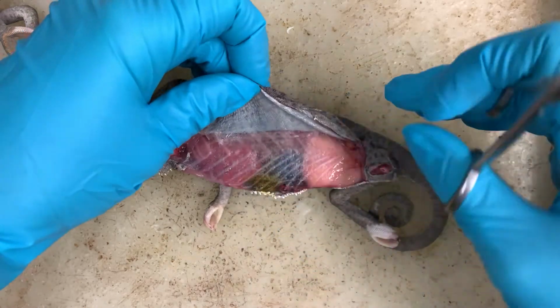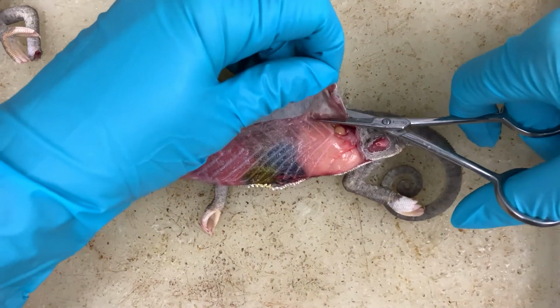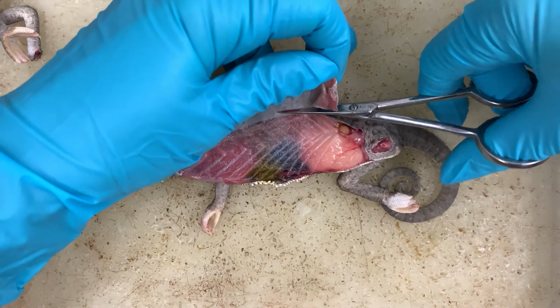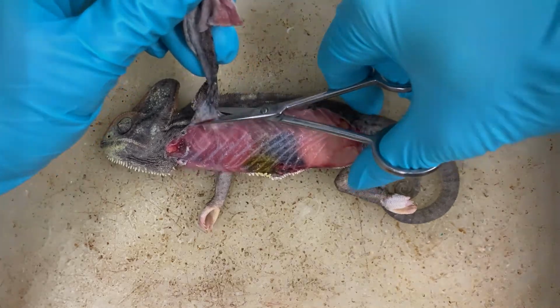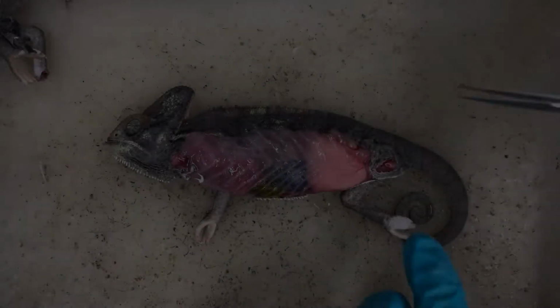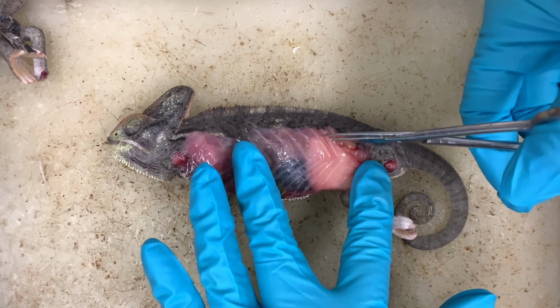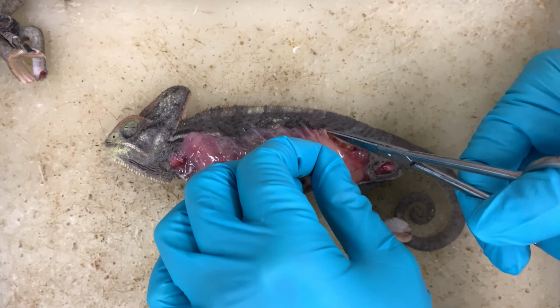Chameleon ribs extend nearly the full length of the body. Chameleons often break their ribs in the wild and in captivity. To access the internal organs, we now cut away the left ribs. This can be done with sturdy scissors.